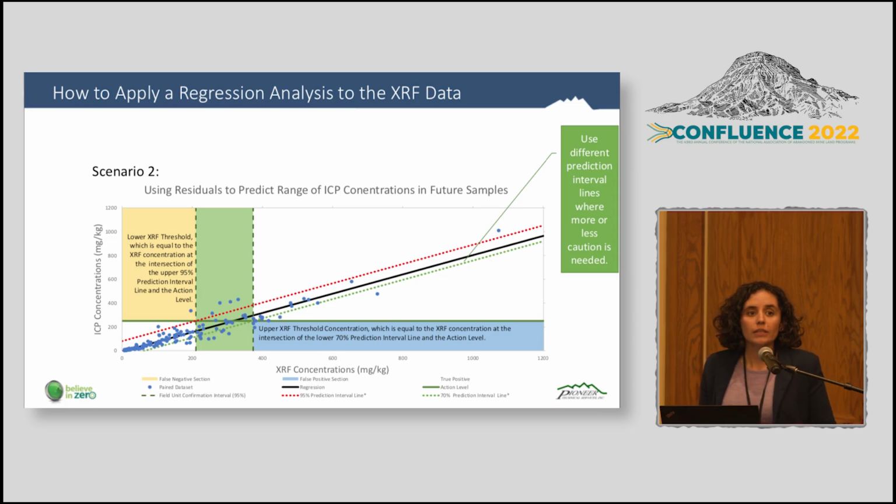And you can use this when we were talking about using the XRF in the field to determine what's waste and what's not.